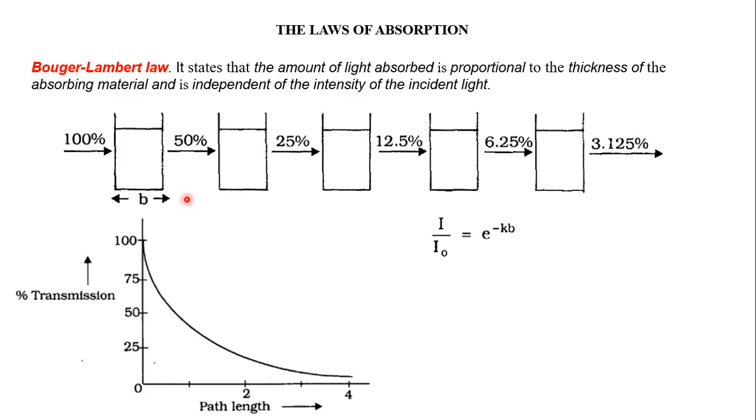Now imagine instead of two gelatin sheets, you are putting 3, 4, 5, and 6 gelatin sheets. What will happen to the light that you are seeing on the other side? It will become more and more dark, and at some point might not appear. So can I put it like this? That the amount of transmitted light will become less and less as you are increasing the number of gelatin sheets masking the light source.